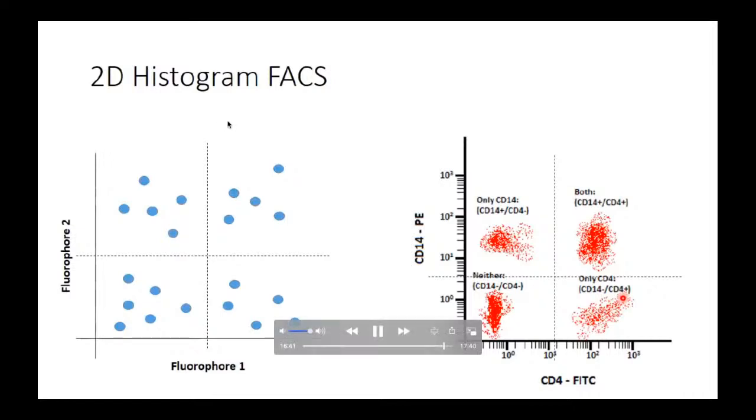As you know, with the new FACS machines, we can analyze tens of proteins and tens of cells at one time. There is now one FACS machine on the market which contains 10 lasers and 30 detectors. Can you imagine 10 lasers and 30 detectors? So you can analyze many proteins and many cells at one time. But of course, the data then will be much more complex than this data. This is a very simple data.